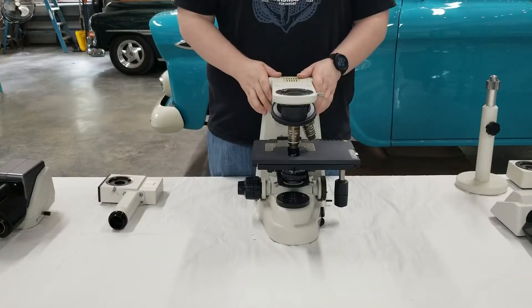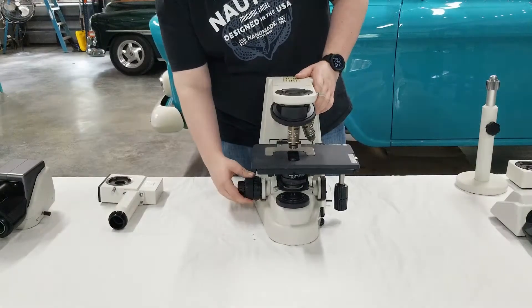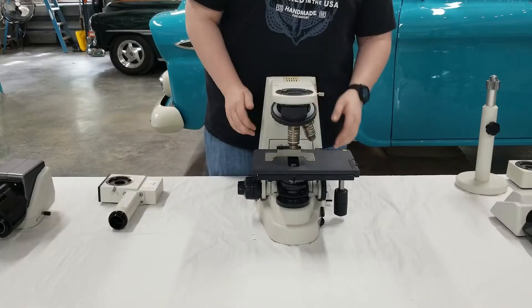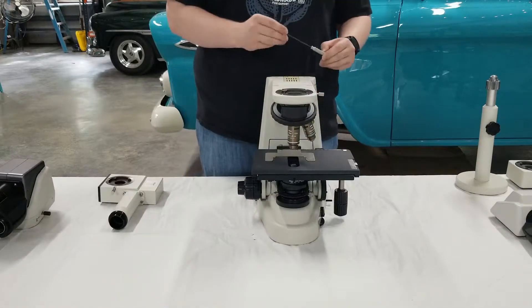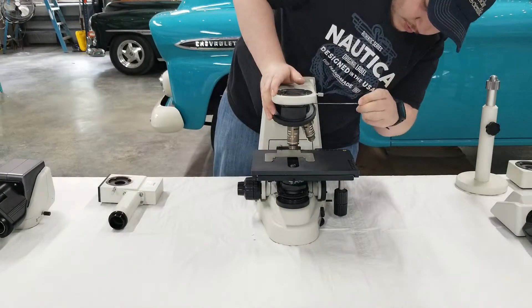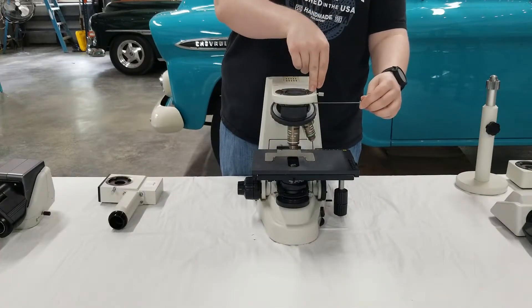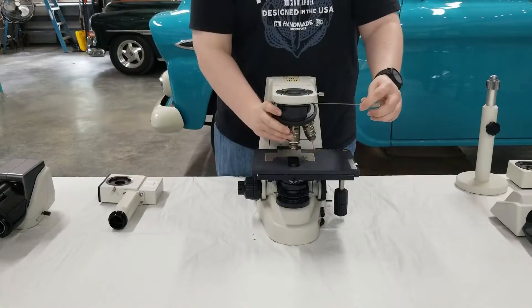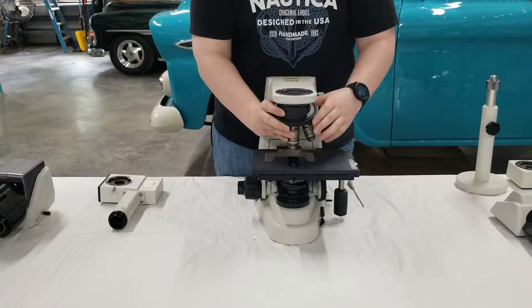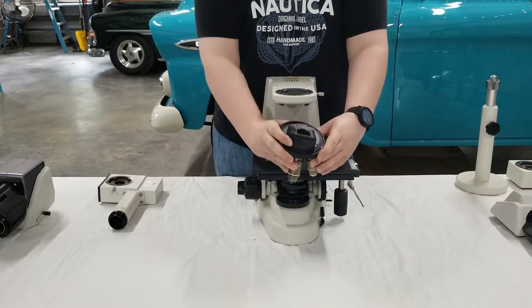Now we're going to go ahead and show you how to remove the nose piece. To start off, you're going to want to lower your stage as low as you can get — this will prevent scratching of your objectives. Then you're going to take your wrench from the lower right-hand side of the scope and slip it into the small screw hole right up underneath where you would mount the head. You'll notice it's in line with the silver screw, so it's a little easier to locate. Then you're going to loosen a few turns. The nose piece is going to slide forward and then you're going to feel it stop — then just lower it down and take it out.